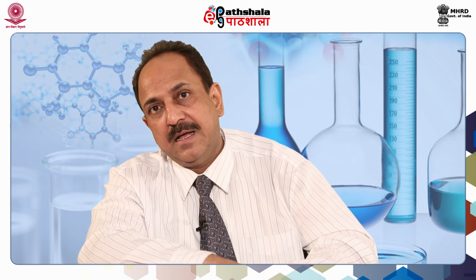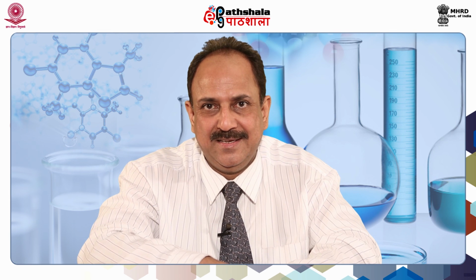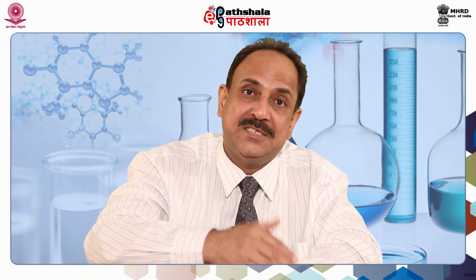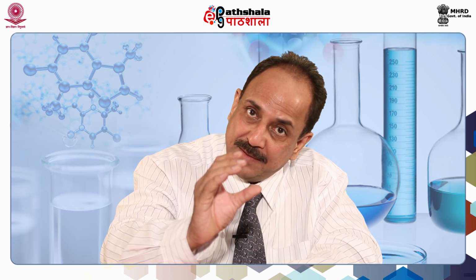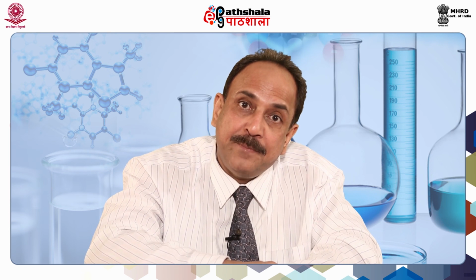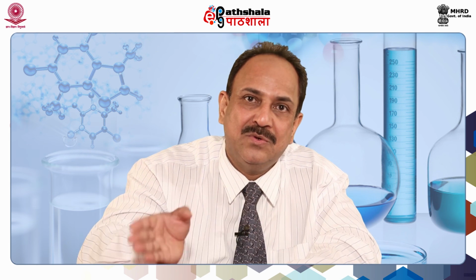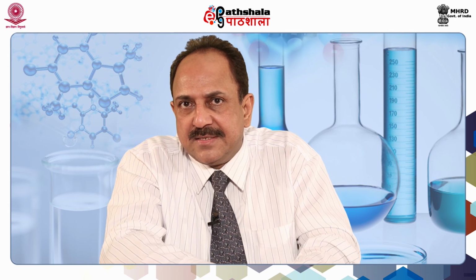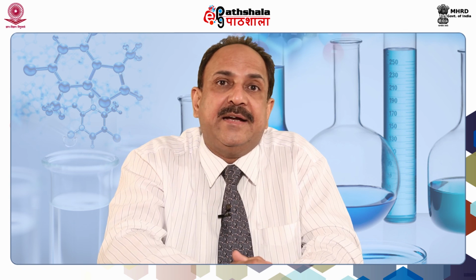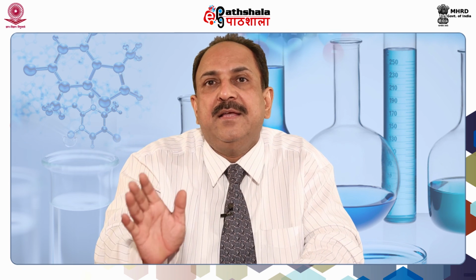Then we learned in this module how to detect the active site binding residues. This helped us to complete the picture with addition of the literature information, so that then we were able to appreciate the real total complete active site in 3 dimensions, real 3 dimensions, with the depth also shown in addition to width and height. Then we also enhanced the graphics, which helped us to understand the mechanism, that is the path which is to be taken by an enzyme for converting a substrate into a product.